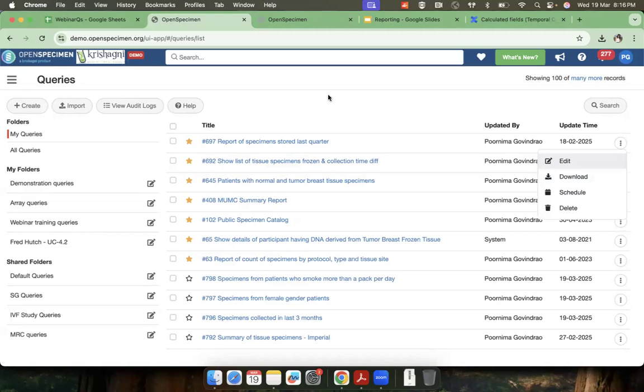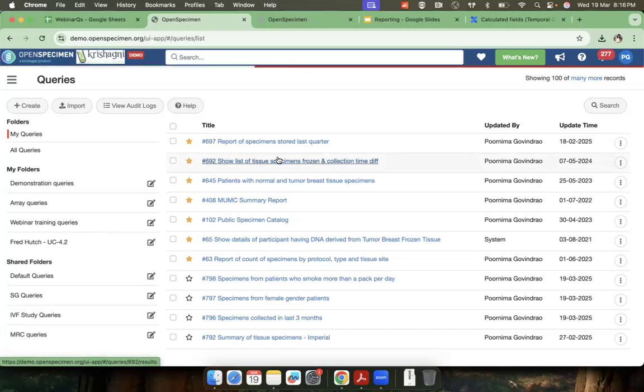If you're satisfied with how it works, you don't have to recreate that query on production. You can download it, and then on the production server, you can import it. So it will create the same query definition, not the values, just the definition of the query in another server. And then you would be able to run that saved query on the production. So that is one thing.